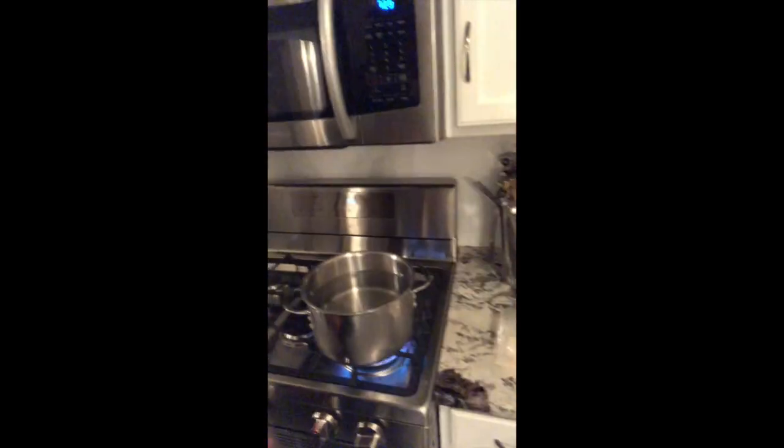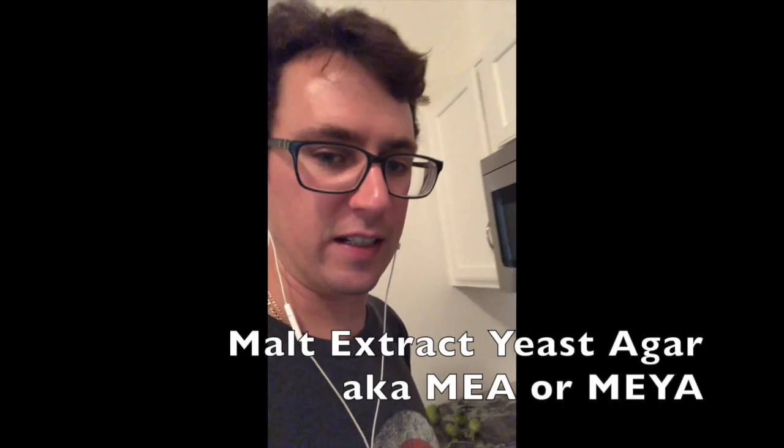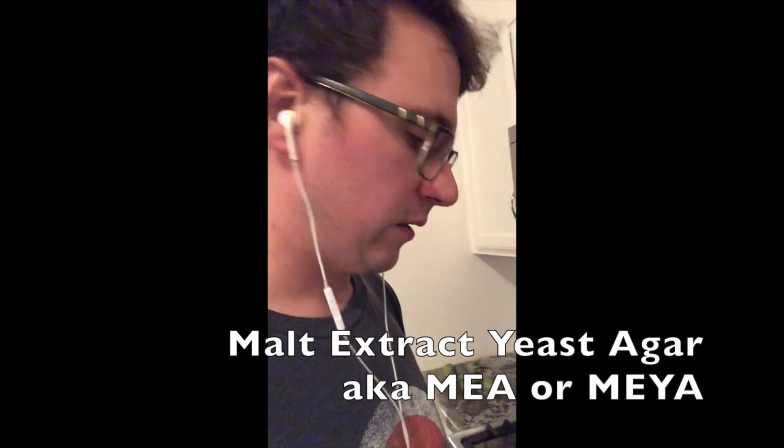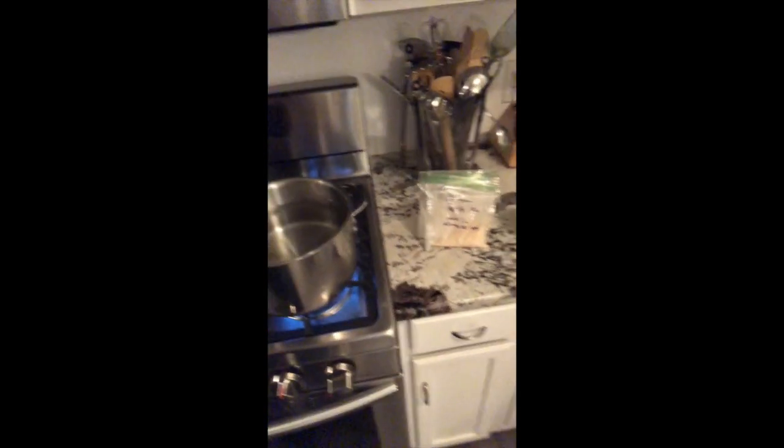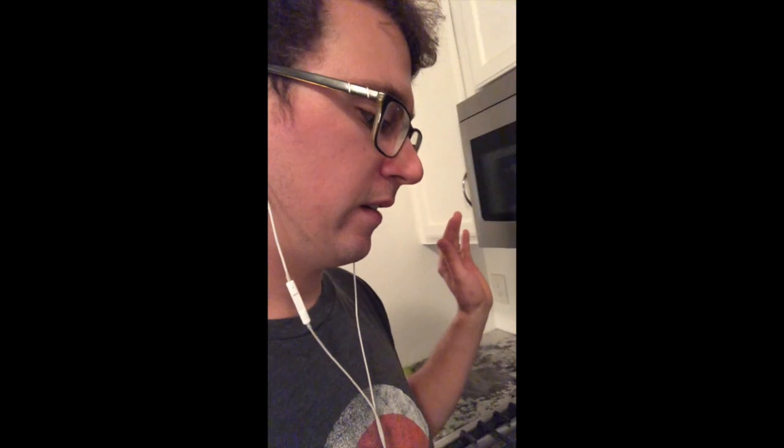So I'm going to be bringing 4 liters of water to a boil. And then I've got 276 grams already pre-weighed out of the malt extract yeast agar. Once this boils, I'm going to be adding the agar and making sure it's dissolved. And then from there, I transfer the liquid dissolved agar into mason jars.